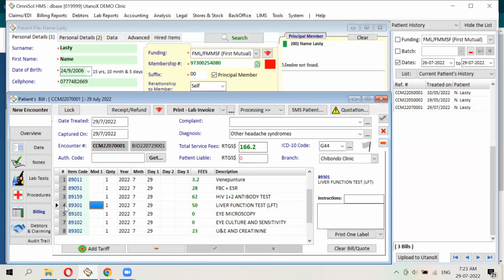Okay, I hear you. And then let's not go too much into detail with this one. Maybe when we do a trial run, then we can be seeing the nitty-gritty. Okay. Then the other thing, the EDI claims, are you able to do it from?